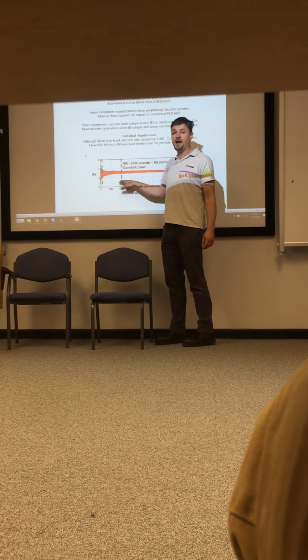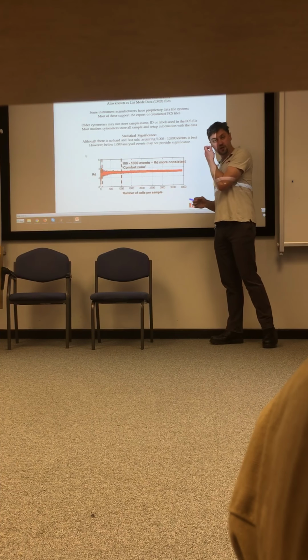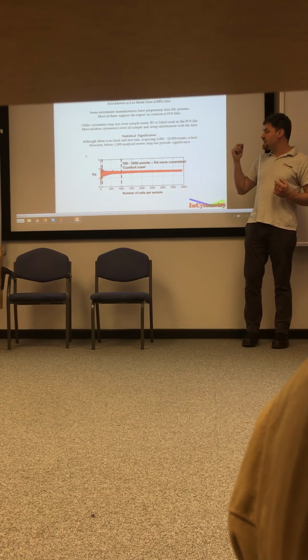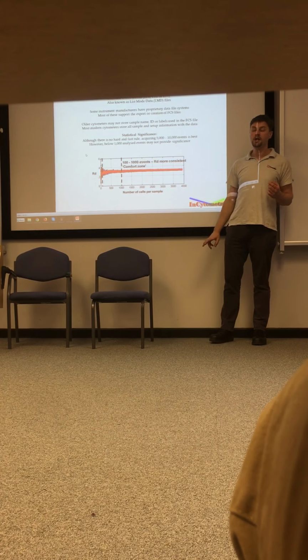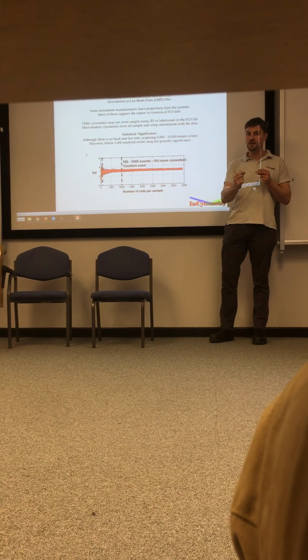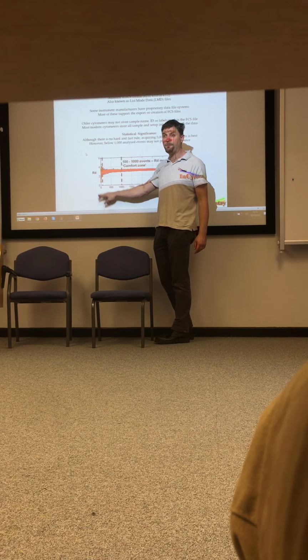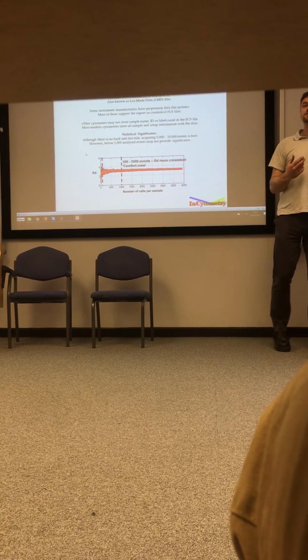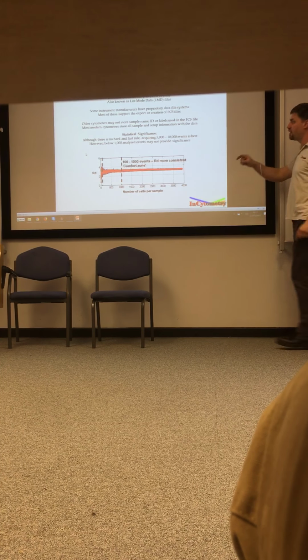So this figure was put together by Amnis for the ImageStream, but it holds true for standard cytometry as well. What they did was take two different samples with different fluorescences, and the relative difference between them should be 3. So if you run 10,000 of them, the relative difference between the two populations will be 3. But first of all, they ran 10 and 10, and they repeated that 50 times. They worked out the relative difference between 10 of them and another 10 of the other population, repeated that 50 times and plotted them here.